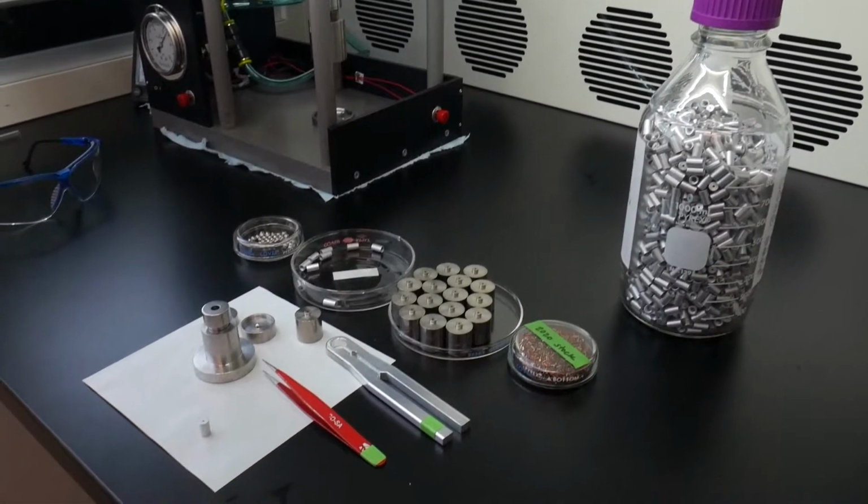So we take the raw material that comes into the lab, clean it up, physical cleaning, removing any contamination from the exterior, chemical treatments if needed, base acid washes or collagen extraction on bone. Following that, we combust the sample to CO2, purified gas. Once it's in that stage, we can graphitize. So we convert that gaseous CO2 to elemental carbon, graphite, and that's what gets measured on the AMS.